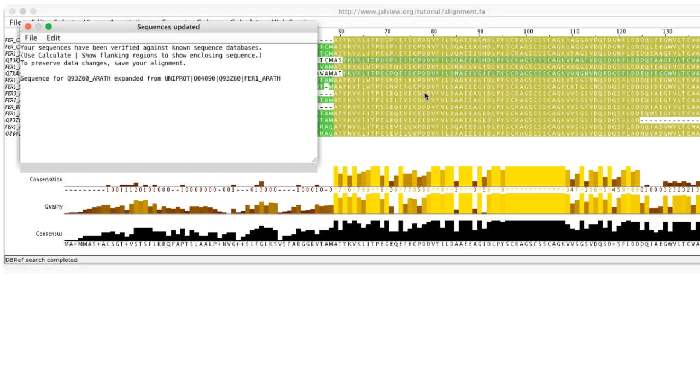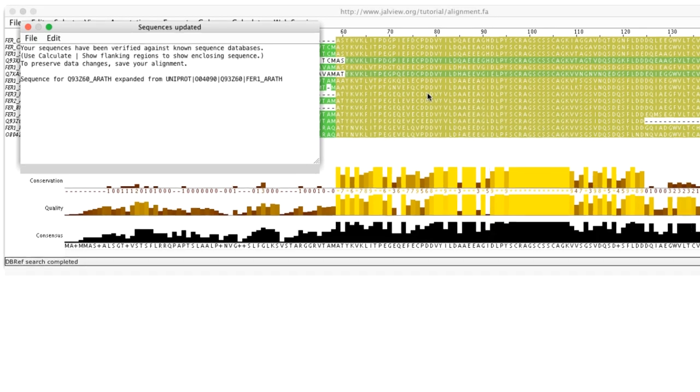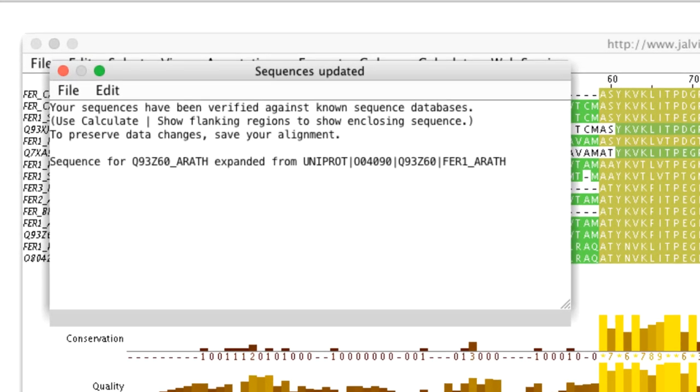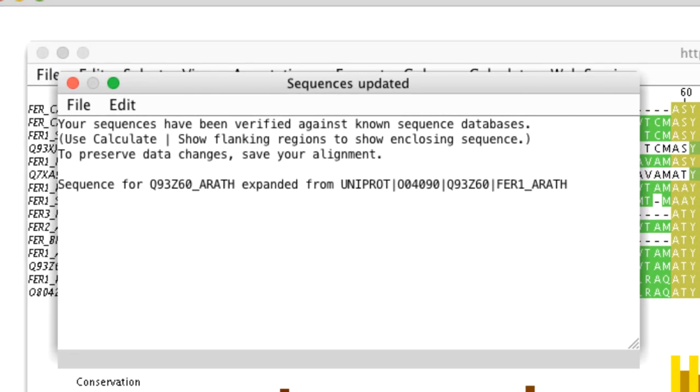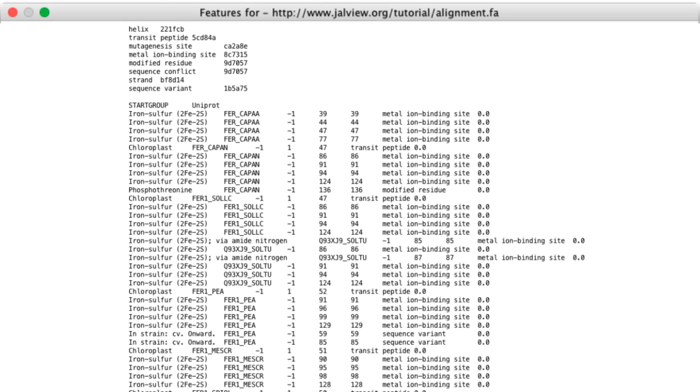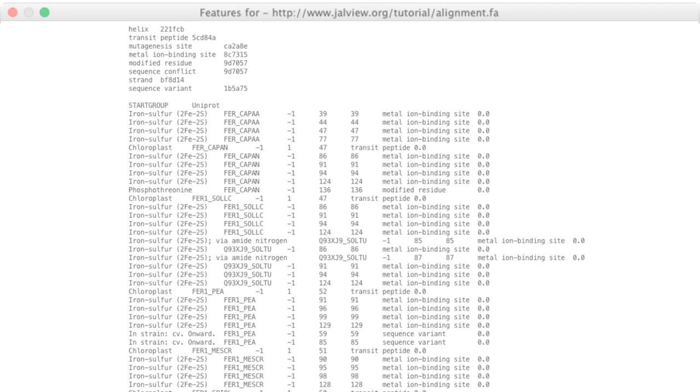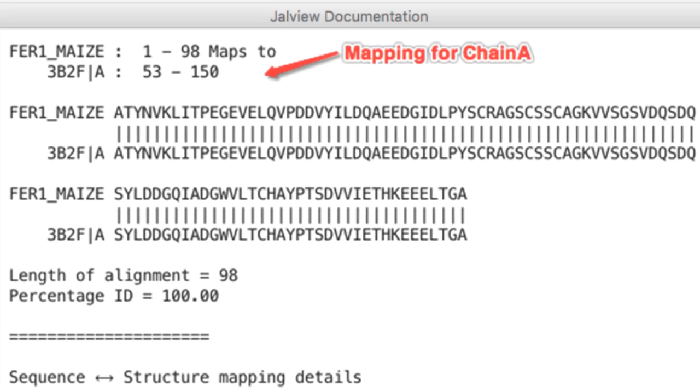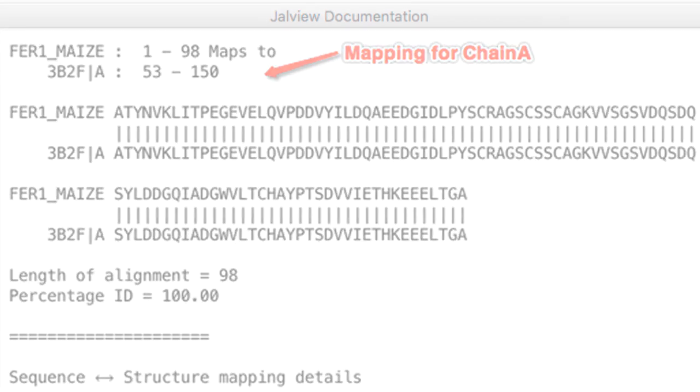When Jalview reads sequences and features from databases, it uses a coordinate mapping system to ensure that features are linked to the correct residue on the sequence. And this reference mapping ensures they remain linked to the correct residue during further analysis. However, if sequences have been modified before the features are imported, for example a residue has been deleted, when the features are imported they will be displayed incorrectly. For this reason I would recommend that features are imported at the start of analysis.